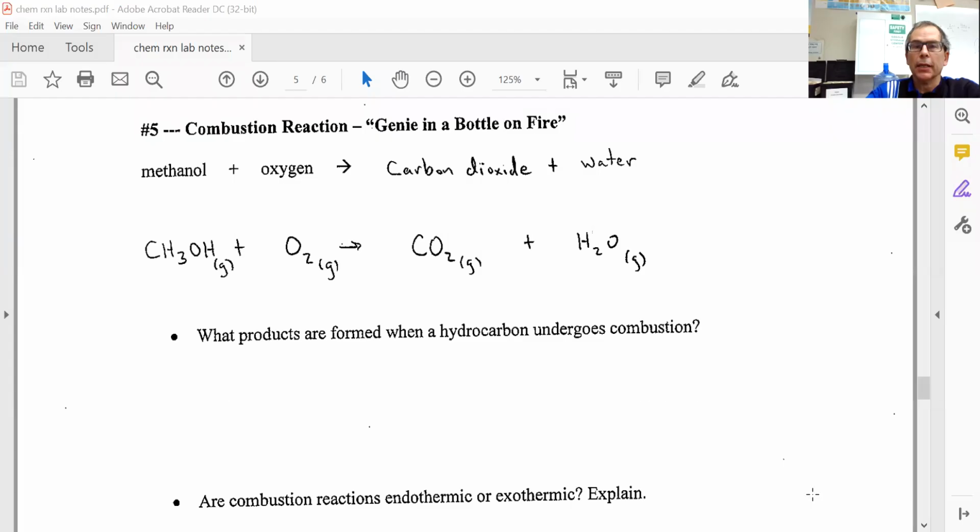In this video, we are going to look at experiments 5 and 6. I'm going to go right to a screen share here. And the first reaction, number 5, is a combustion reaction, and it's a genie in a bottle on fire.